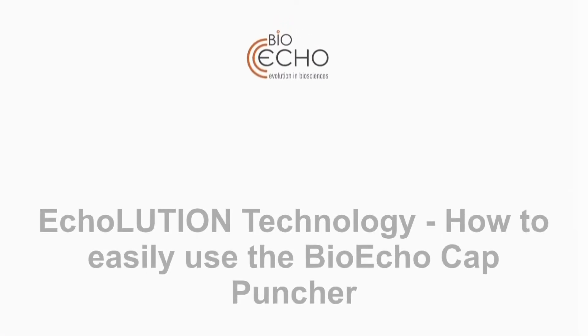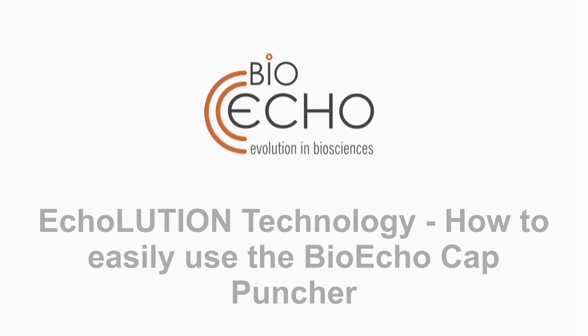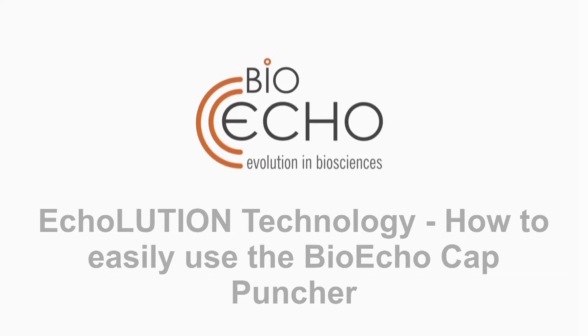In this one minute tutorial we will demonstrate the easy use of the BioEcho cap puncher for most comfortable sample loading onto Echolution spin columns.